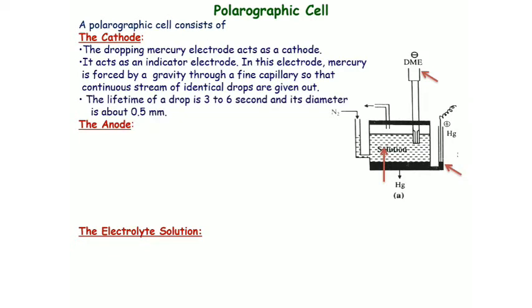The lifetime of a drop is about 3 to 6 seconds, and its diameter is very small. It is about 0.5 millimeter. Lifetime is 3 to 6 seconds and diameter is 0.5 mm.